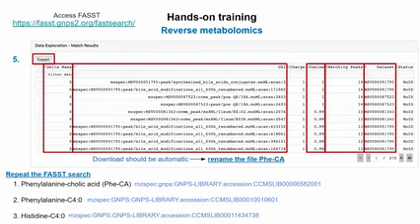I have one question. When you're searching fast in GNPS, there are a lot of M plus H adducts. Which one do you have to select? We just have multiple spectra deposited for the same molecule, right? So the idea is to get the more representative ones, the ones that usually have a lot of peaks and good intensity, because you're going to have different matches, and you can also have a lot of false positives.